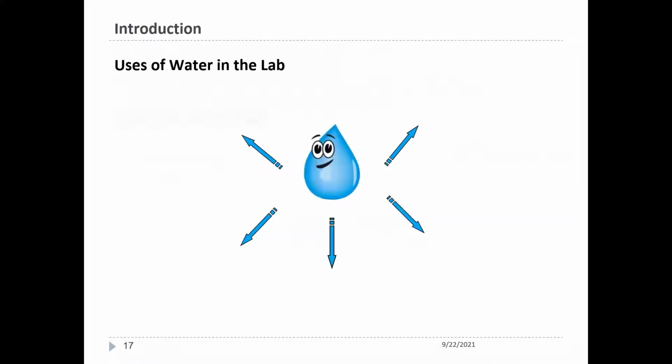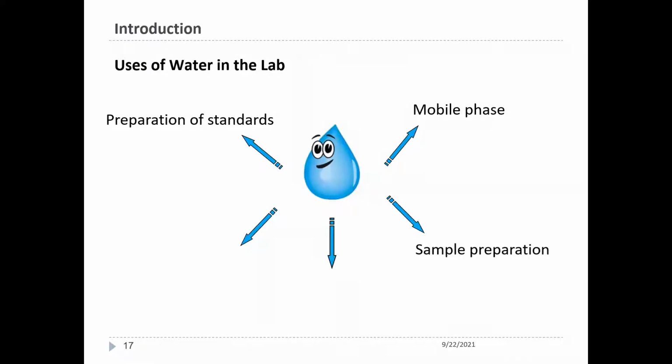So we look at the water. We say we need water to prepare our standards, for the mobile phase for those who do HPLC, for sample preparation, to prepare our blanks, which is very critical, and then washing of glassware and rinsing of containers. We need water for that as well.